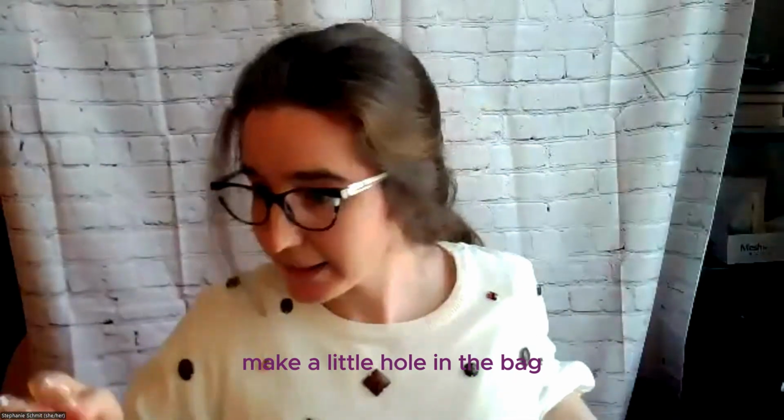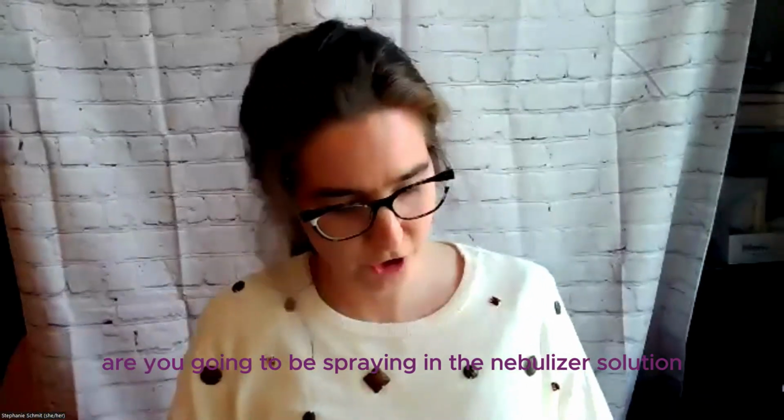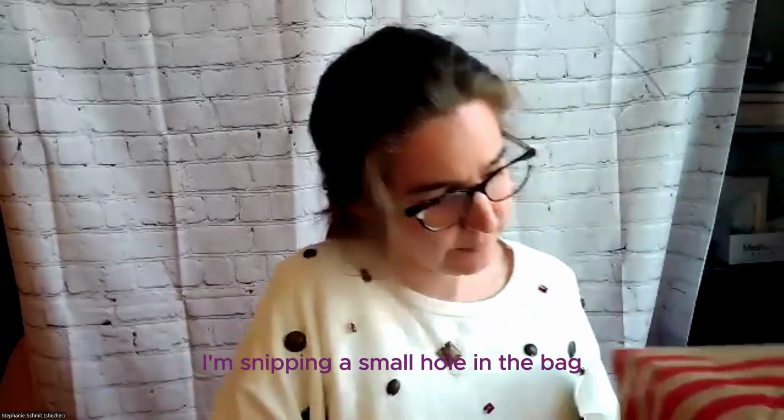Make a little hole in the bag. And that's where you're going to be spraying in the nebulizer solution. I'm snipping a small hole in the bag. Small hole in the bag.